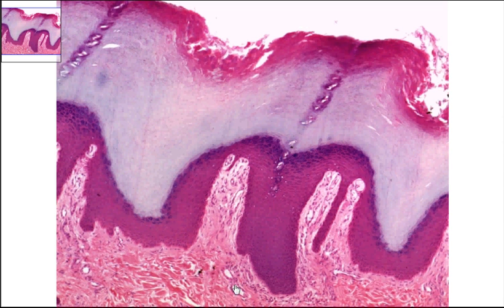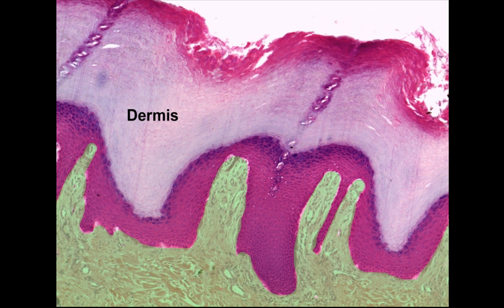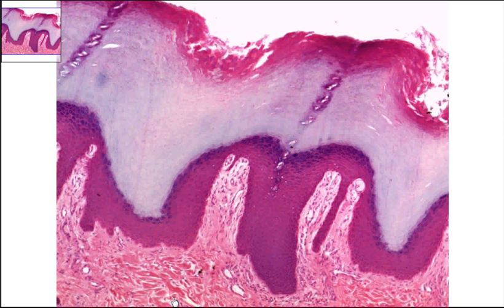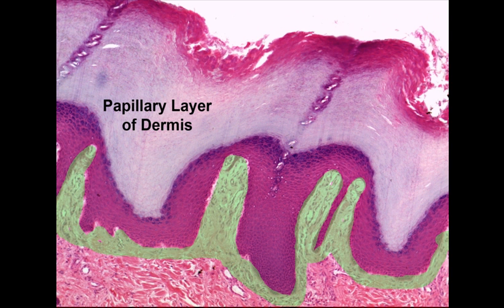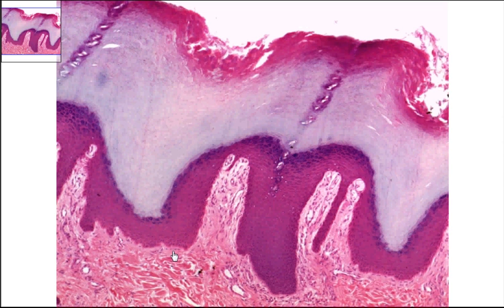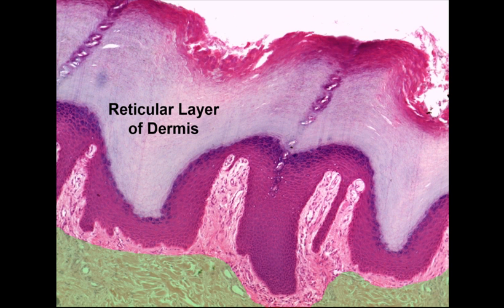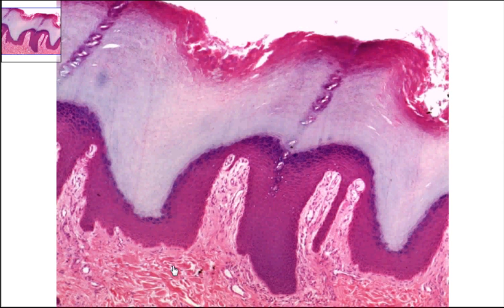The hair follicle actually originates down in the dermis. This more pinkish red color down here is the dermis. You cannot see the entire dermis on this slide — it would go even further down below. The dermis is made up of two different layers: you have your papillary layer, which is this little tiny piece up here, mostly made of areolar connective tissue. And then you have the reticular layer down here, which would continue beyond the slide and is mostly made of dense irregular connective tissue.